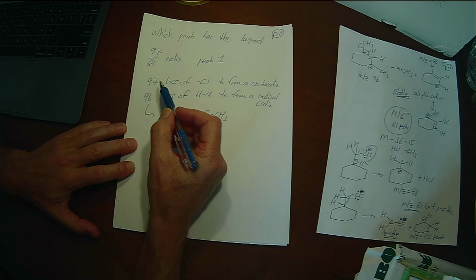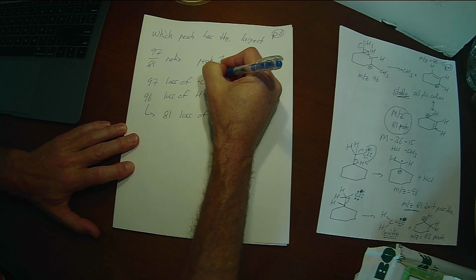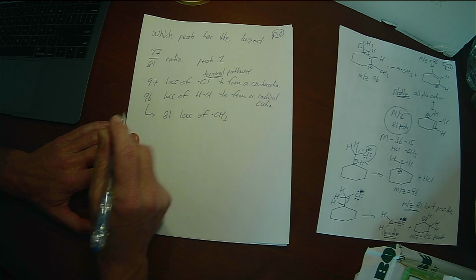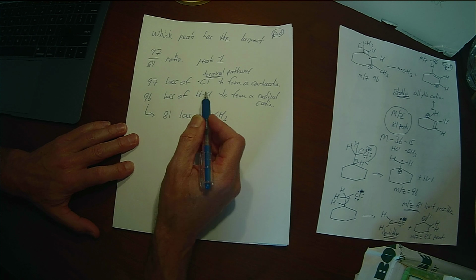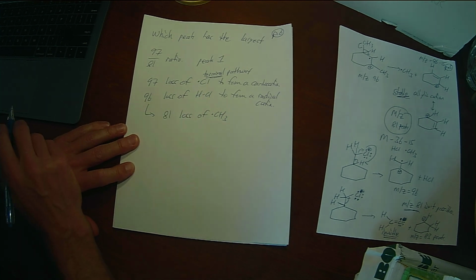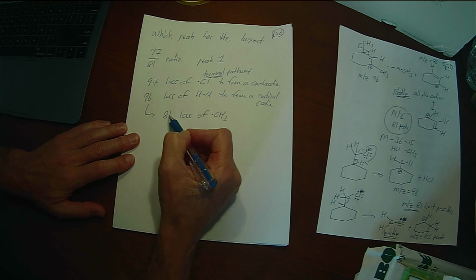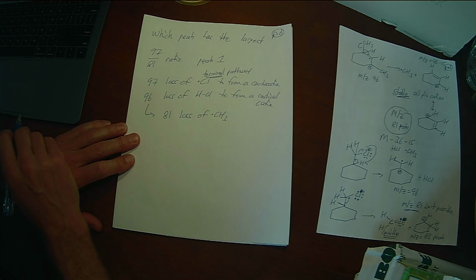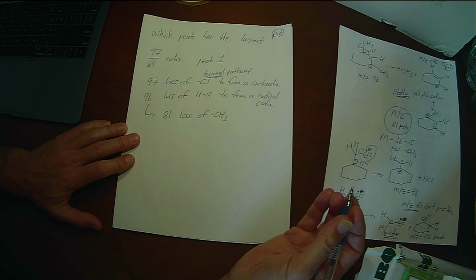So if you lose chlorine, that's a terminal pathway, right? It can't go any further because we've generated a carbocation that's not subject to further rearrangement. If you lose HCl, that's not a terminal pathway. We can then lose the methyl to form the 81. So the one that has the largest 97/81 ratio is the one that loses chlorine the most readily. And which one should lose the chlorine most readily?